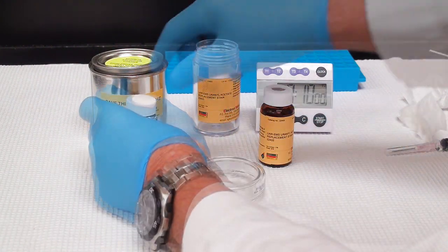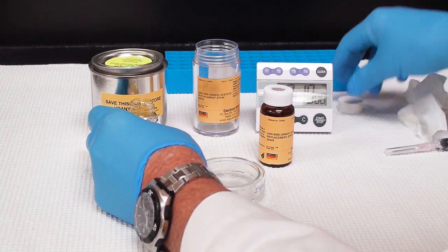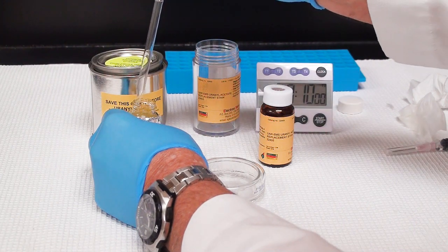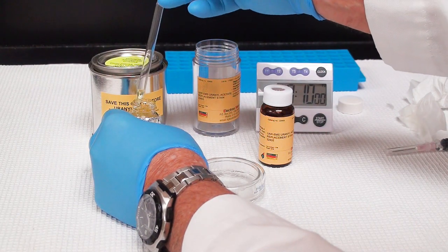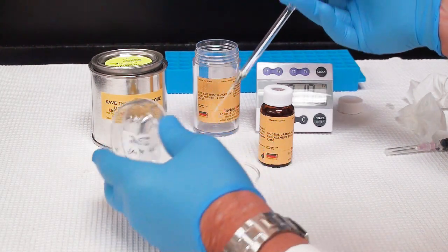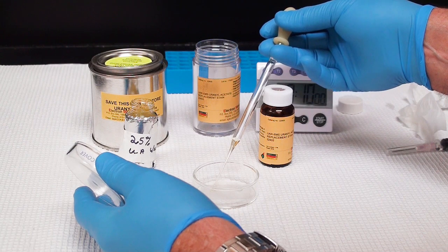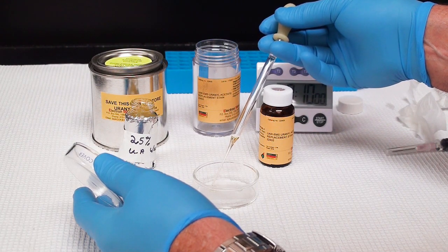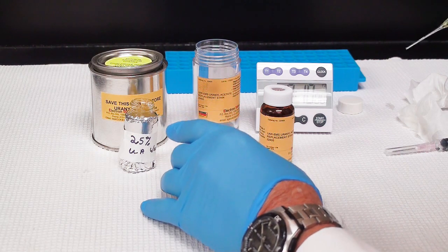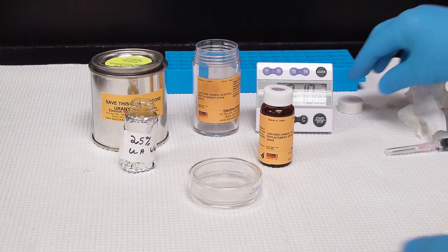I'm going to save that because I'll be doing the microwave. When I do my uranyl acetate, I like to use a glass pipette versus the plastic transfer pipette. So I'm using a pasteur pipette. I'm just going to draw some up in there, and then I'm just going to place a drop of the UA on the parafilm.